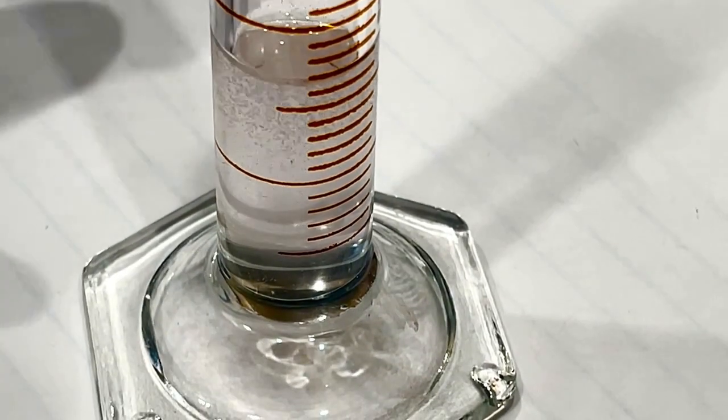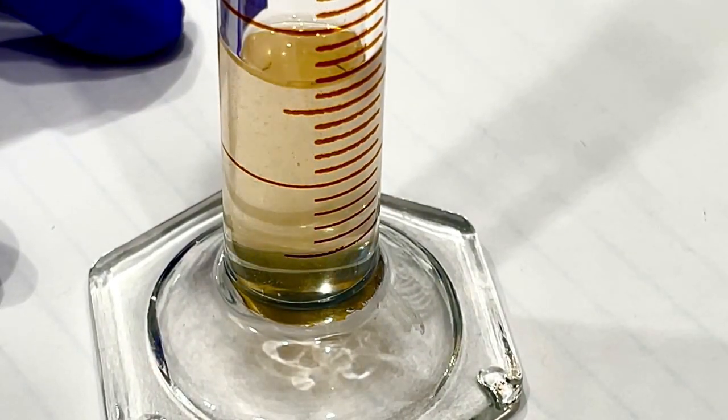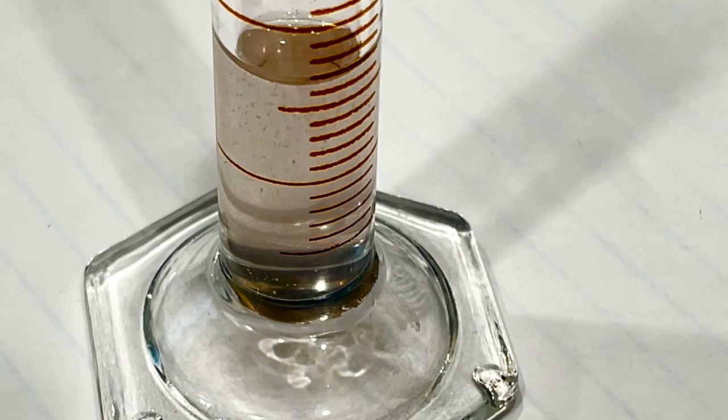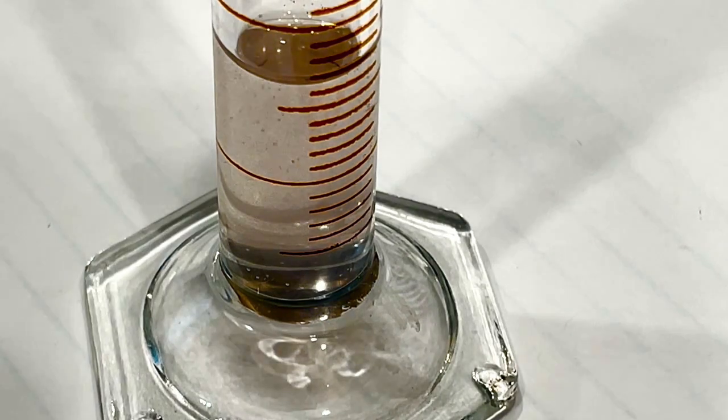In this experiment, I recreate the iconic Briggs-Rauscher oscillating reaction. In this reaction, two competing reaction mechanisms result in a reaction intermediate, in this case iodide ion, that oscillates in concentration. One reaction mechanism results in the concentration of the iodide ion increasing, while the other results in the concentration decreasing. Which mechanism dominates is determined by the concentration of iodide, and the reaction switches off between these two mechanisms.